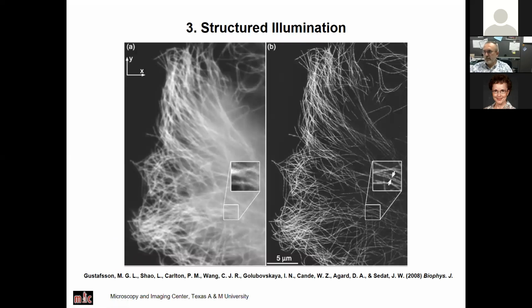Okay, so here is an example. Everybody loves to image microtubules because it's really easy to demonstrate how well it works or not. So this is your regular wide field image, and this is your structured illumination image where you were able to resolve several closely spaced microtubules.